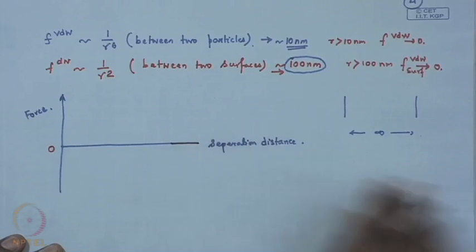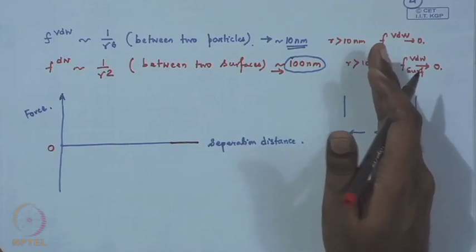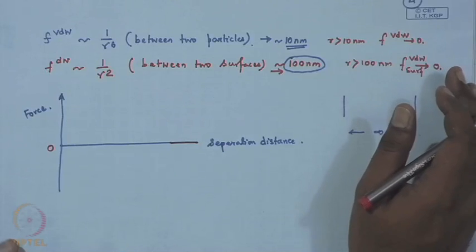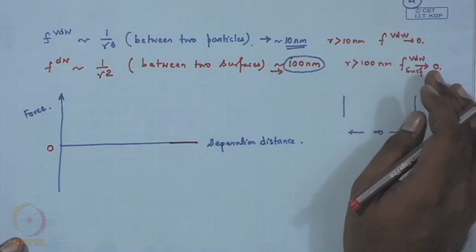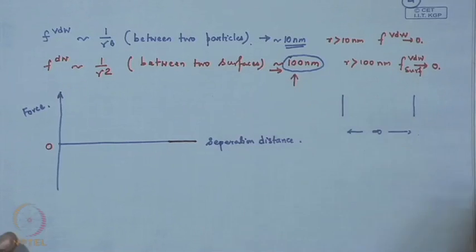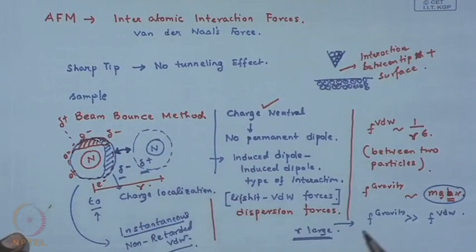Now, think of the fact that you are progressively bringing one of the surfaces in close proximity to the other. If we are talking about the van der Waals potential or the force arising because of van der Waals interaction, we already understand that this stretches a maximum of up to 100 nanometer. The other thing we understand is that the nature of this interaction is attractive.